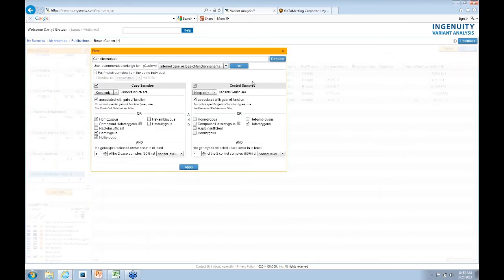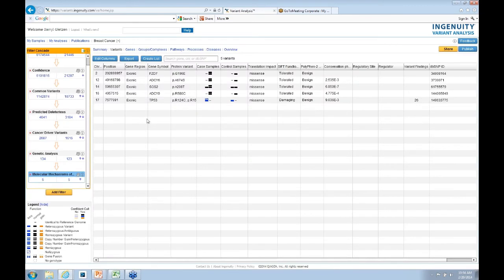And then when I just close this, because the saving is done real time, I will then have my de novo filter basically as my working version. So that's an easy way to kind of save off versions. I told you to do that. I recommend doing that and save those versions off and then annotate them while you're thinking about it.